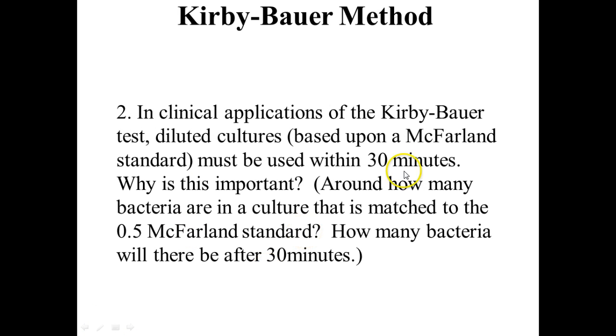And then the McFarland standard, right? Another reason why I prepped it right in lab today. It must be used within 30 minutes if we're truly following the protocol. And the reason for that, for an organism especially like E. coli, is that in a matter of 20 minutes under optimum conditions, it would double. So you'd have a doubling of the amount of bacteria. And so we want a pretty standard, but notice we didn't use the spectrophotometer. We kind of eyeballed it to that pre-made standard.